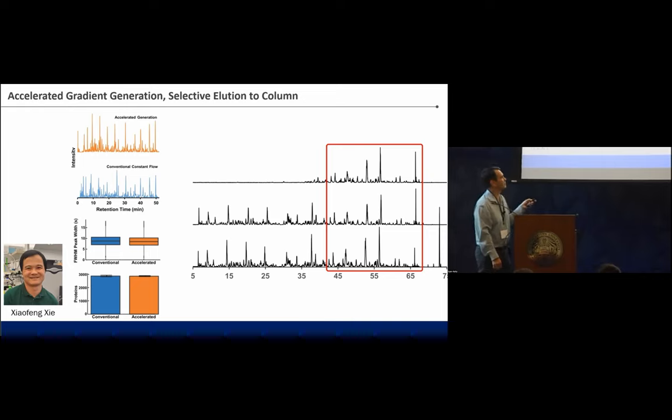And this is like 30-minute gradient single cell analysis. And I should say, as we were developing this, it was done with 60-minute gradients originally, and it was just working so well. Everybody that had any samples in the queue was like, before you take this away or change anything, I need to run my samples. And so we ended up running 600 or 800 LCMS runs with the same columns here, because we're able to really protect them. They just see the good stuff.